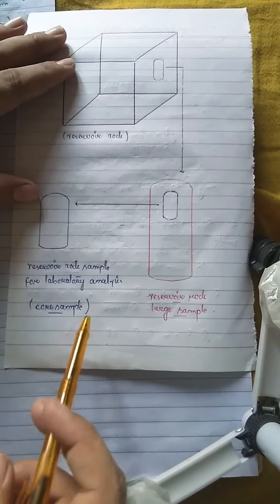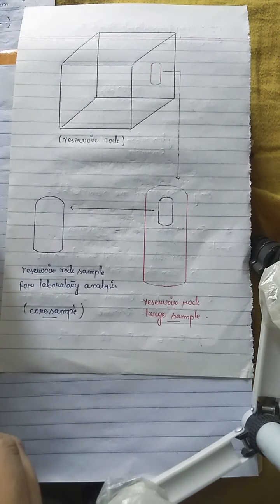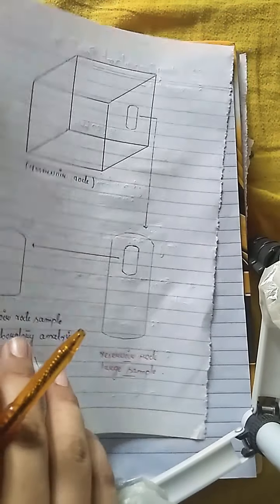Obviously these core samples usually have volumes of some cubic centimeters. Their volumes may range from point something cubic centimeter to 10, 12, 13 cubic centimeters, depending upon the requirement of the experiment and the instrument that we are using. Okay, so this is the point which was necessary to clear.